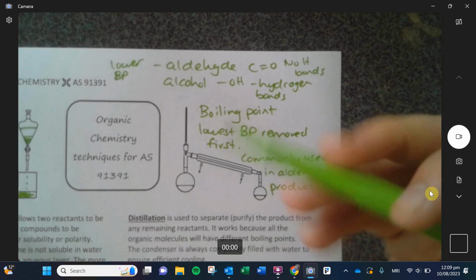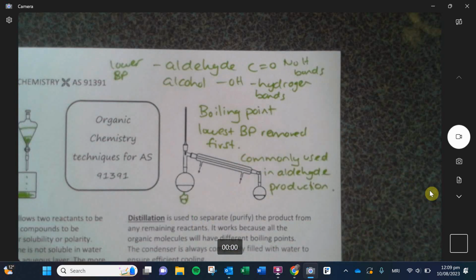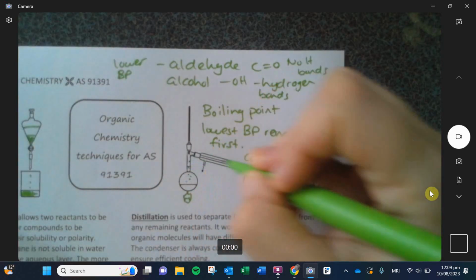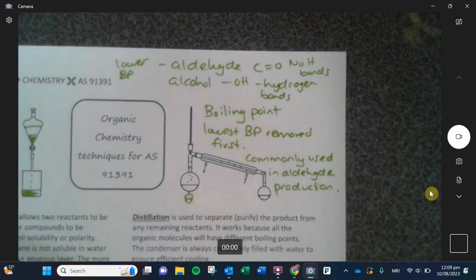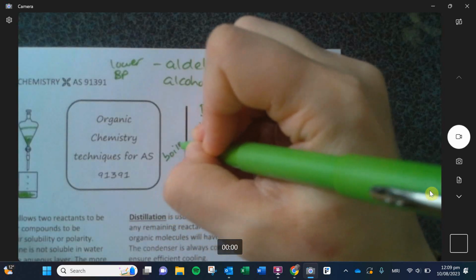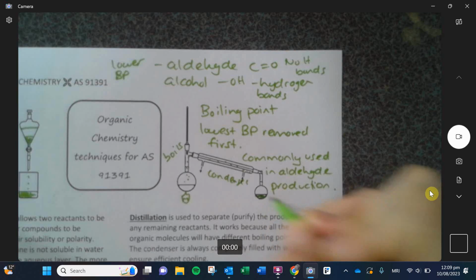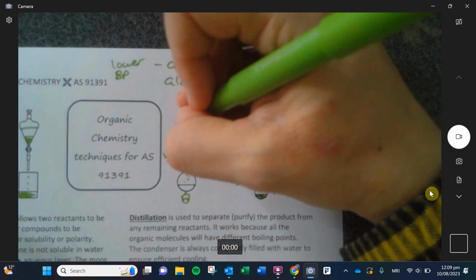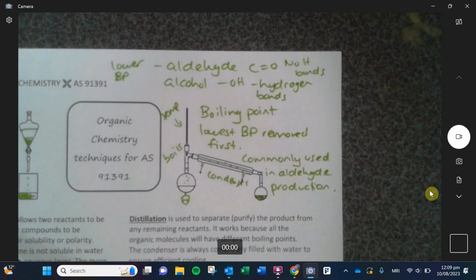So basically, when we're looking at distillation, we heat a lot of our reactions because that speeds up the chemical reaction. Things start to boil, and then it goes down this condensing tube and then chills. So it boils over here, and then it condenses down here. And then this becomes the pure product. And then we often have a thermometer to measure the temperature, because that temperature is really important. If we overshoot the temperature for the boiling point, we're going to start boiling off the second substance.